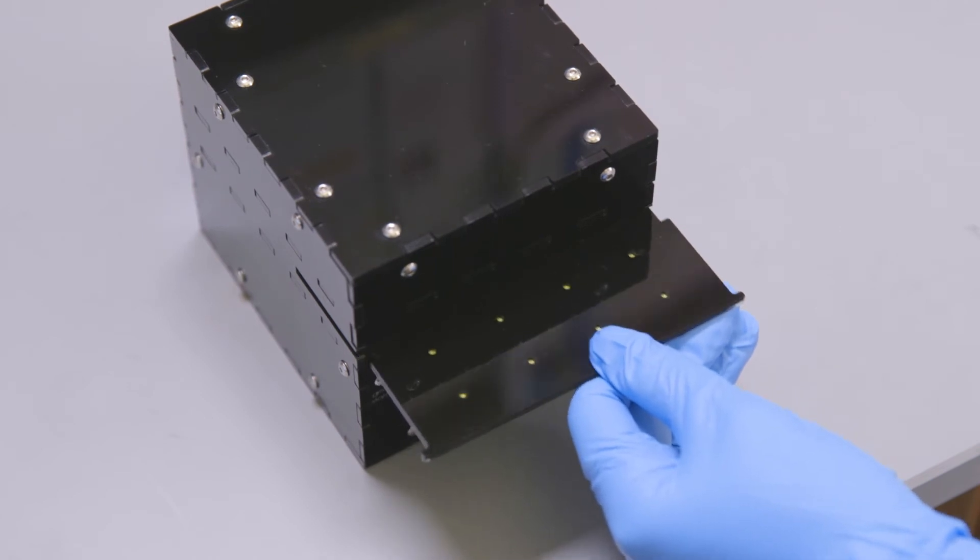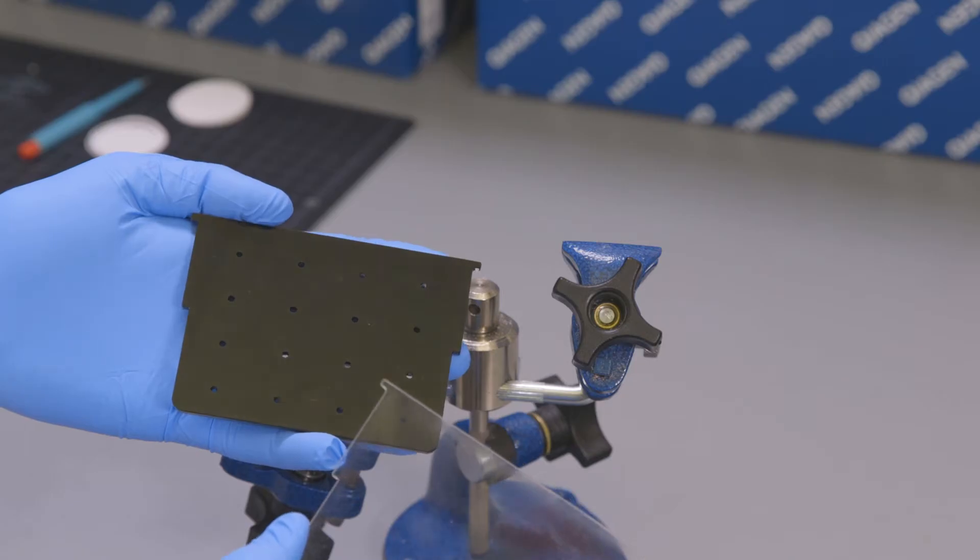Next is the cartridge layer, which holds the paper discs. The cartridge is made up of two laser-cut pieces of acrylic.